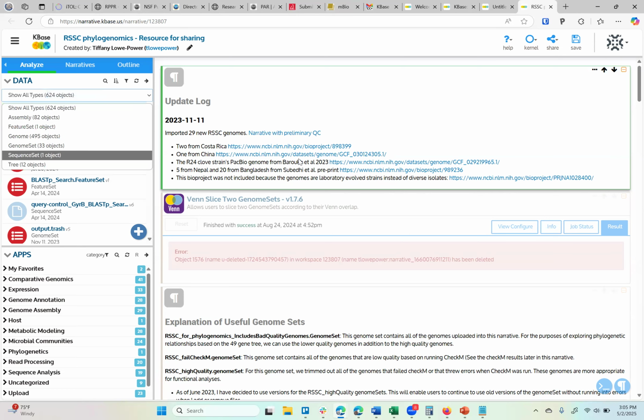And so enough has been run in this narrative by me that it has some memory problems, and sometimes it can be very slow to work with and load within the computer browser.